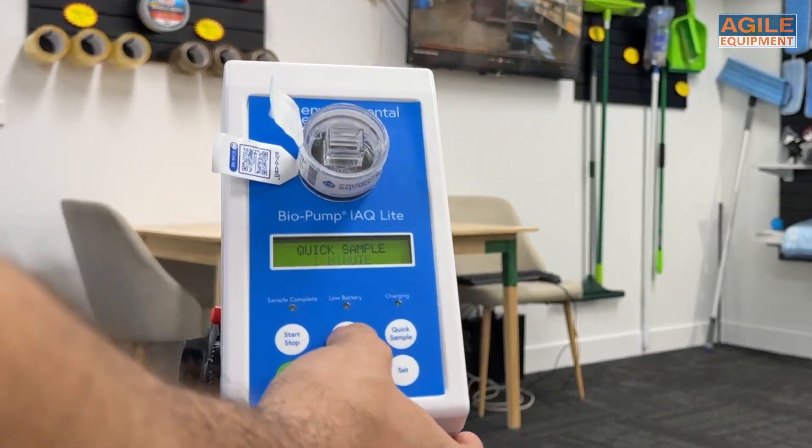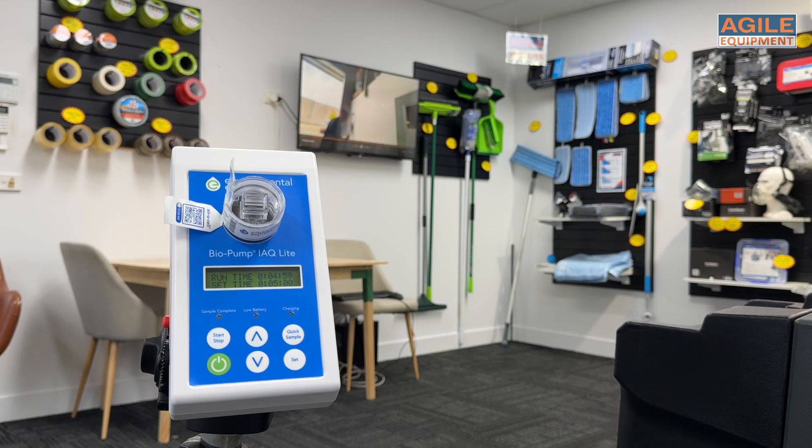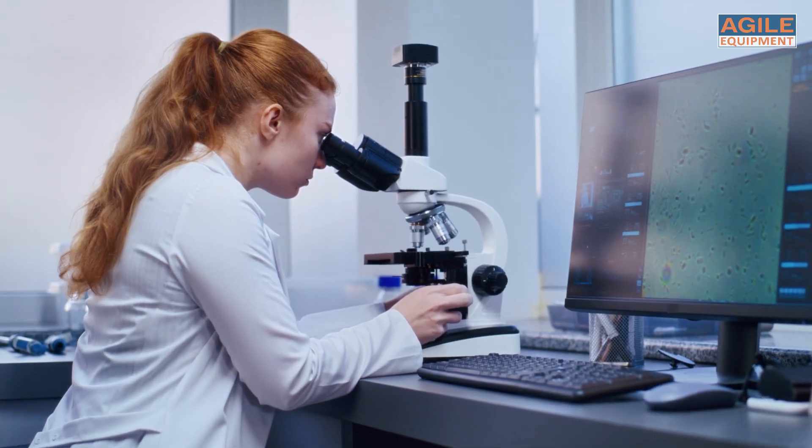Need a different sampling time? That's easy. You can just adjust it using the arrow buttons. Once the sampling is complete, simply remove the aerosol cassette, seal it, and send it to a professional lab for analysis.